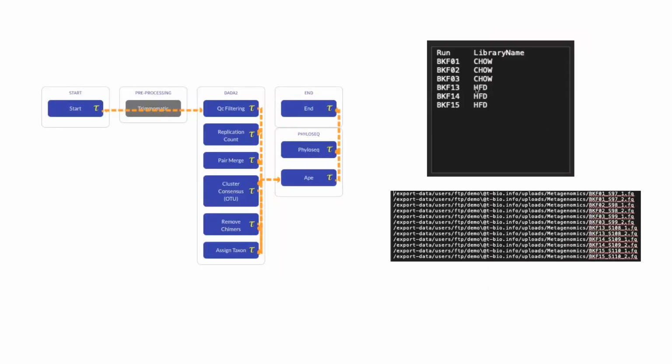So what we need to run this pipeline are two files. The first file are the sequences. These sequences could be from NCBI, where you found the SRA run table, or they could be already stored on the system. So here, for example, you notice that each one of the samples has two files. Why is that, do you think? Why do we have two files for each sample?